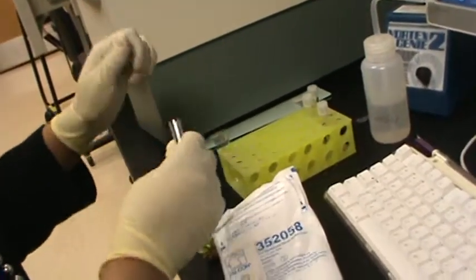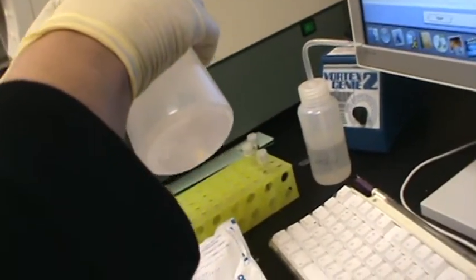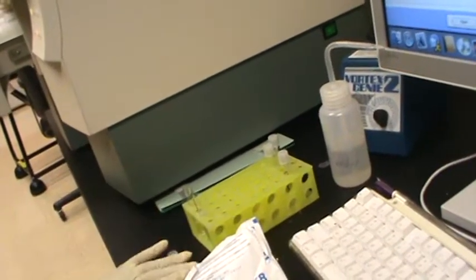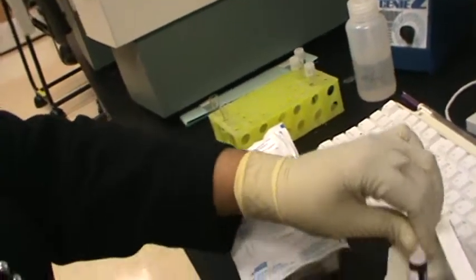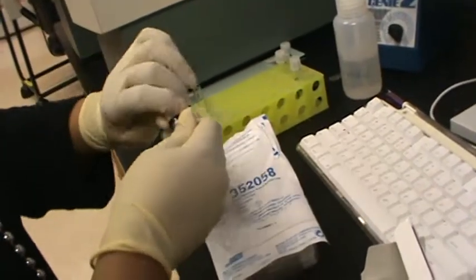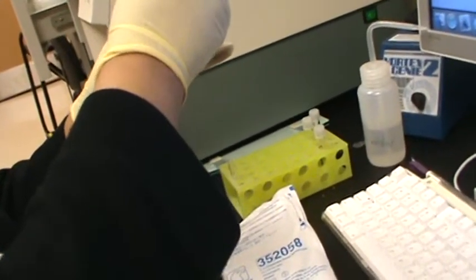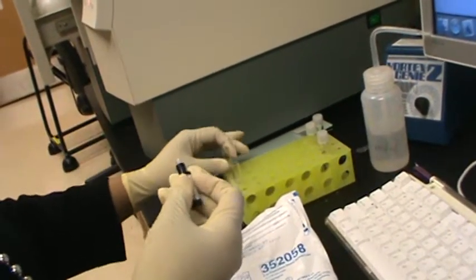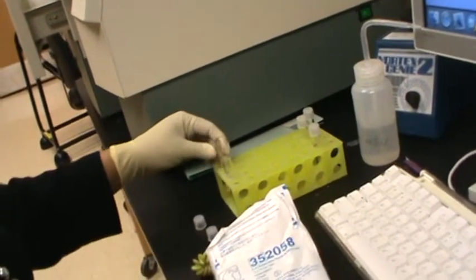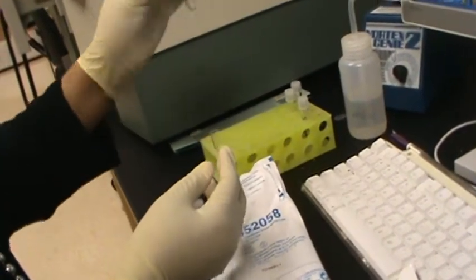The labeled with all 4 will have about 3 mils. And again, you can gauge it. Doesn't have to be exact. We take our unlabeled first, and you vortex. And you put it in the 1 ml, and you use 1 drop. The black is unlabeled. Try to mix the solution.